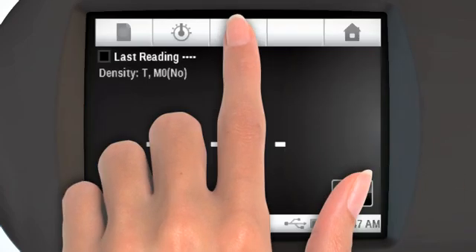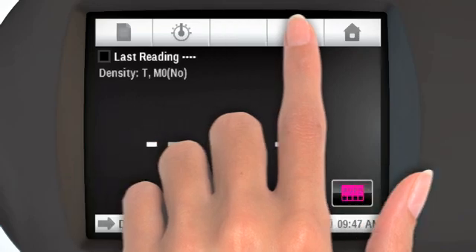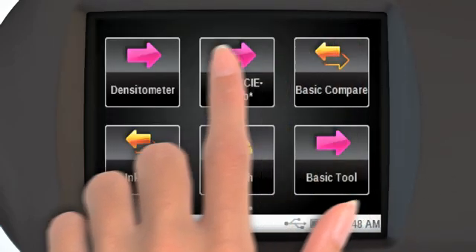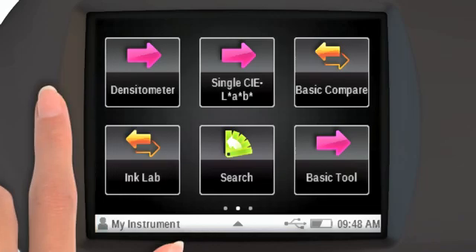At any time, to return to the main menu, tap on the home icon here. I'll explain how to use each of these tools in detail in the next modules.